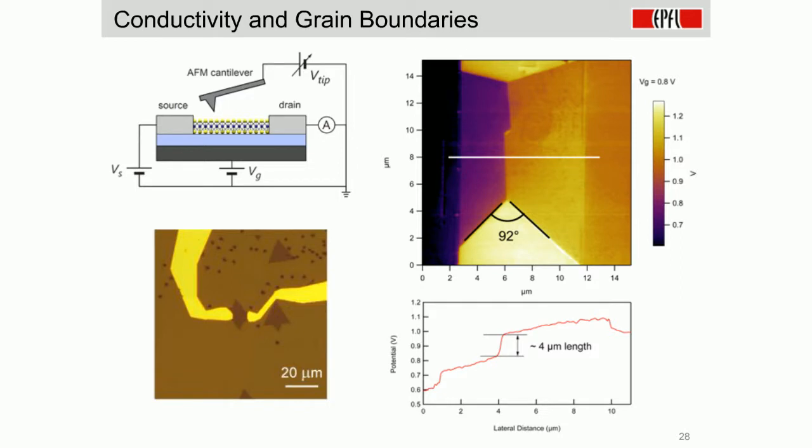On the left and right sides, you have the two electrodes, which appear homogeneous, and there's a big potential difference between them. The object in the middle is the two single crystals of MoS2, and they appear with more or less homogeneous colors, except that in the middle you have this discontinuity.